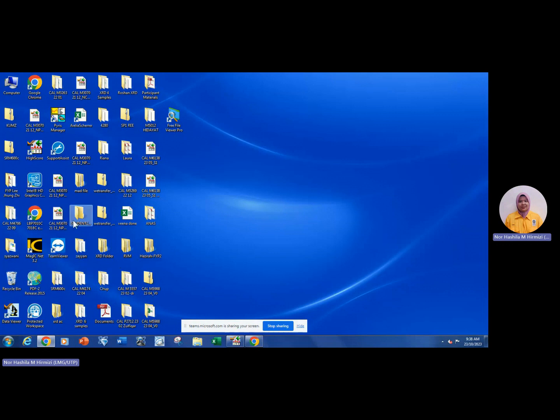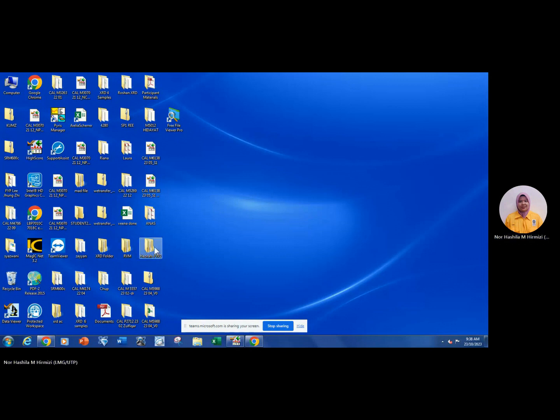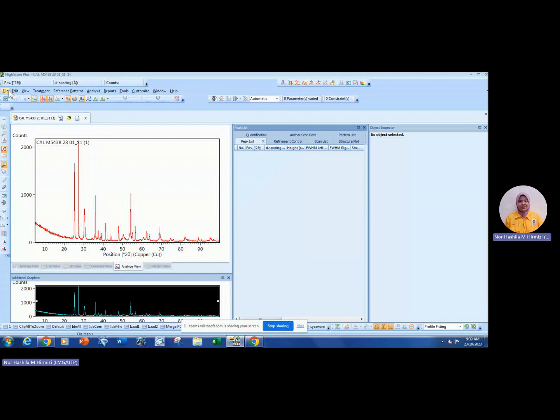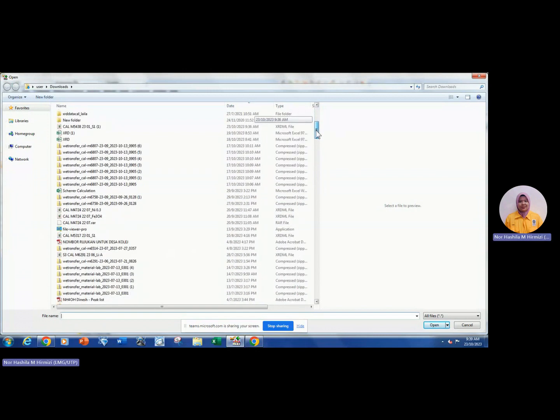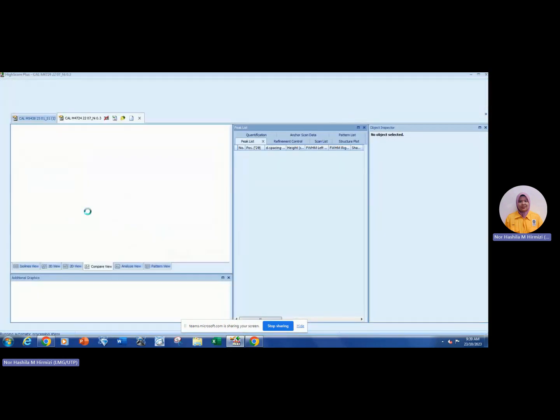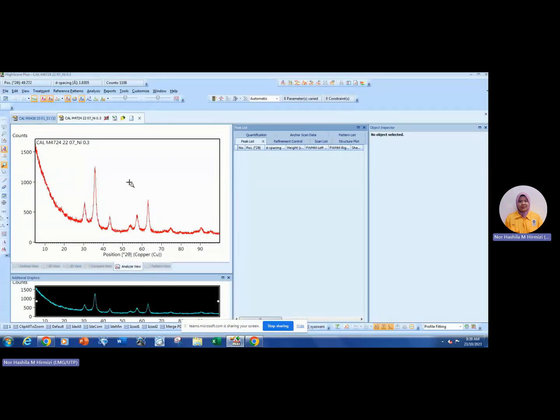First of all, you need to open the HighScore software. Just double-click and it will come up. Then if you want to open the file, click File, Open, and choose your XRD file — for example, like this one — just double-click and it will come up like this.